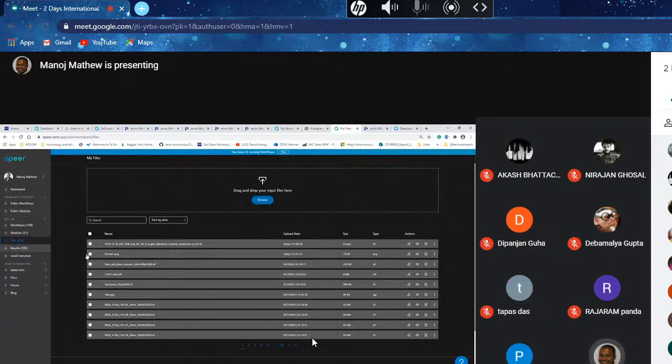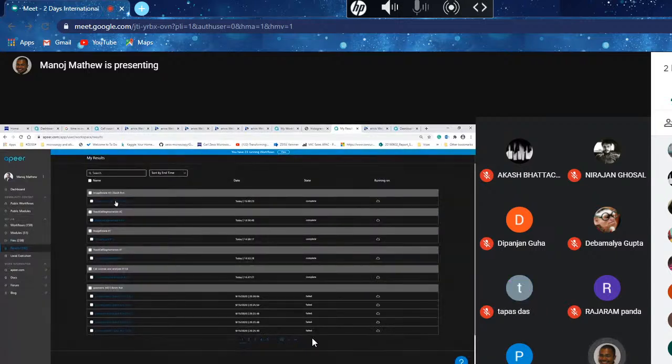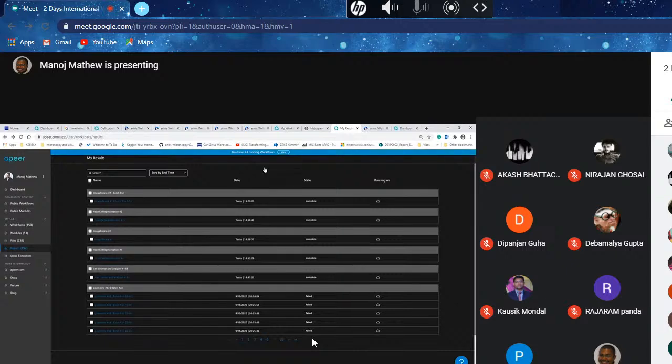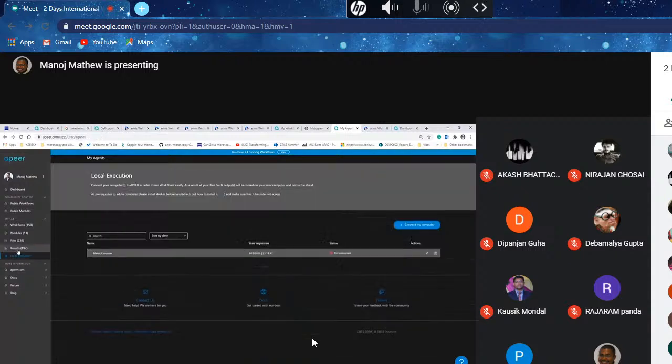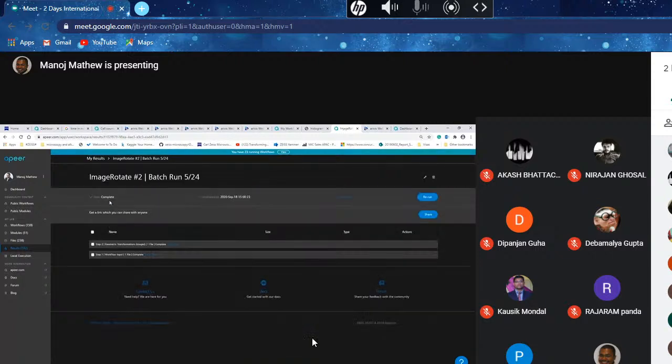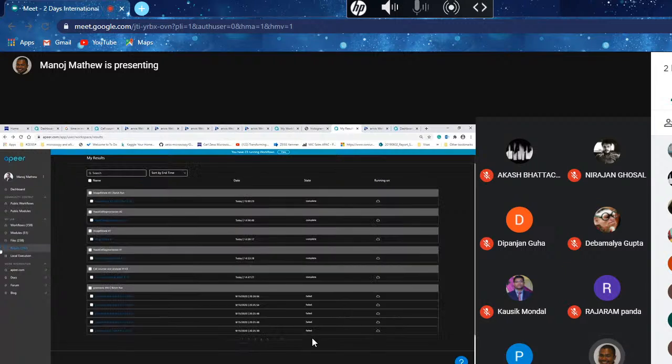Let me check my results again. Yeah, see the image rotate. One of them is complete. Number 5 is complete. Yeah, let it run for now.